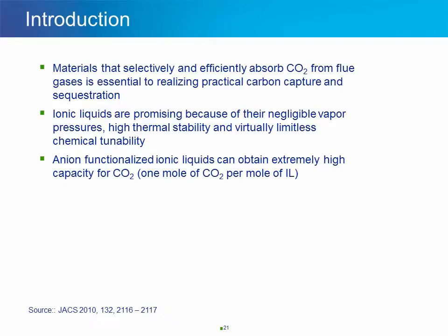This is a JACS communication, so it's relatively short. I chose it primarily because it's an excellent illustration of how rich in information the mid-infrared spectrum is, which provides researchers with detailed structural information about the molecules. This allows them to gain a detailed understanding of reaction mechanism. I also chose it because of its relevance, again, to the greening of our world.